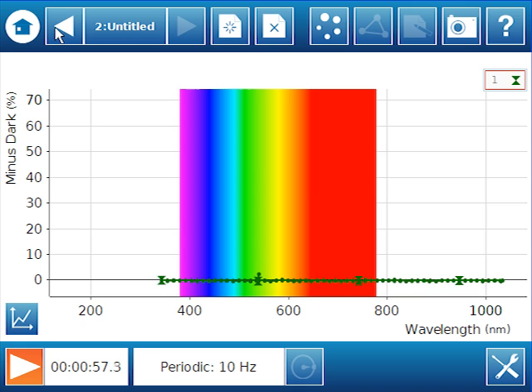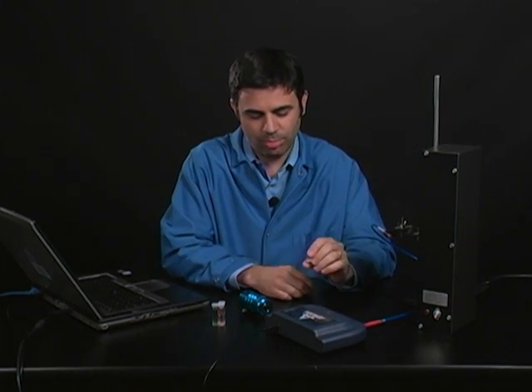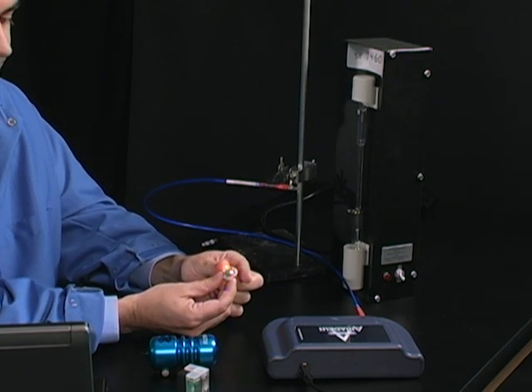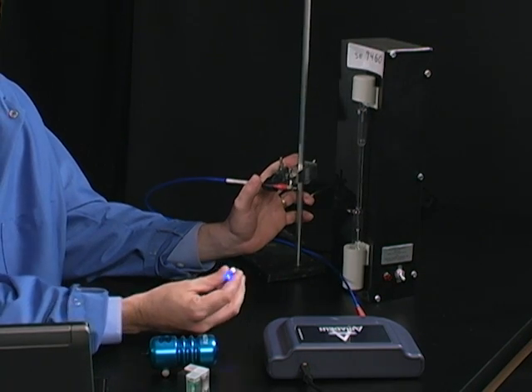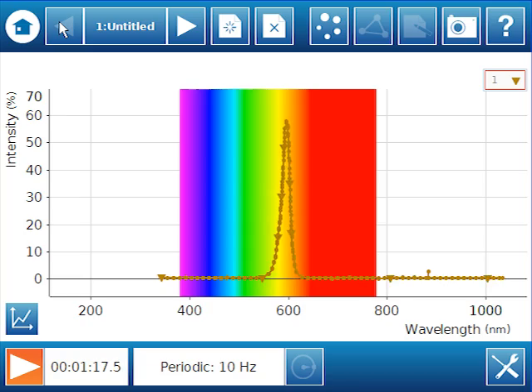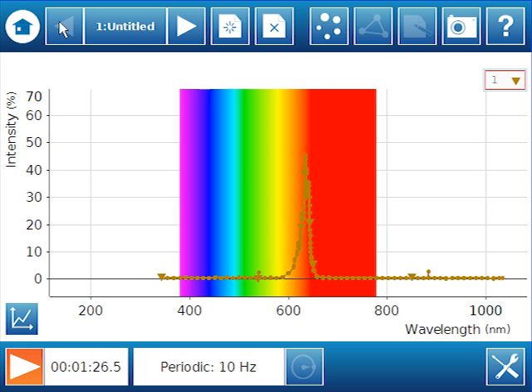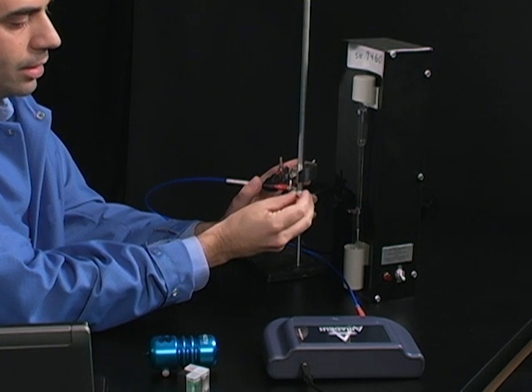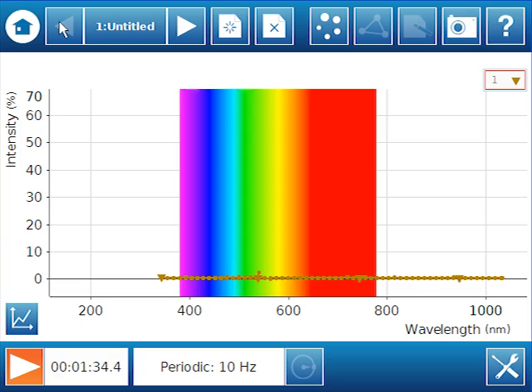And first, I'm going to look at a toy and see what's happening. So I have a little battery-powered blinking LED light. And it's giving off red, yellow, blue. So we'll see what's happening. We'll look at each of those individually. So if I look at the yellow light, I put that up to the fiber optics. Then I get this nice peak at yellow. That makes sense. If I look at the red, I get this nice peak in the red part of the spectrum. And if I look at the blue, I get this nice peak in the blue part of the spectrum.